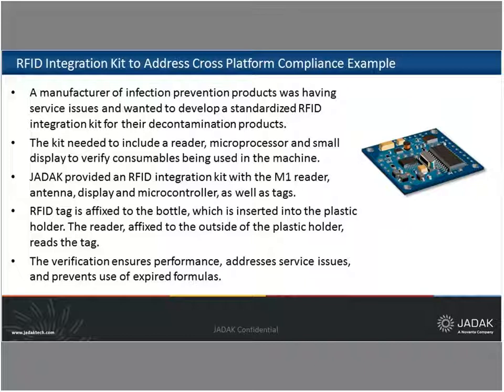And also, ultimately, that the product had not expired. This made sure that the formulas were properly configured and used in the specific applications or specific devices, and that misuse of these did not happen.